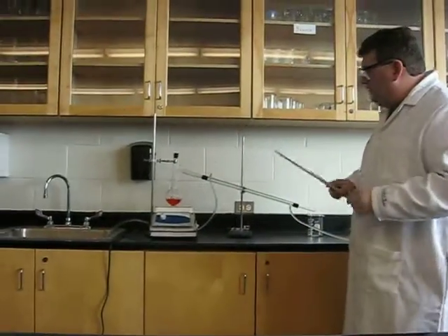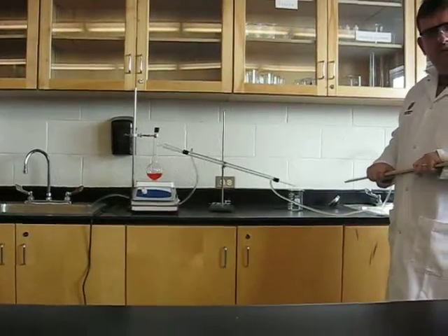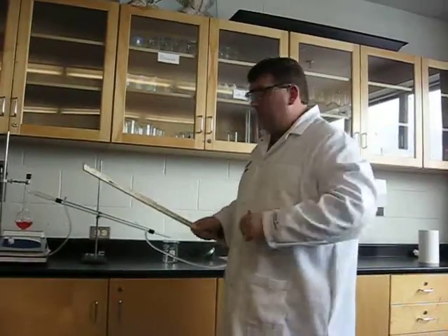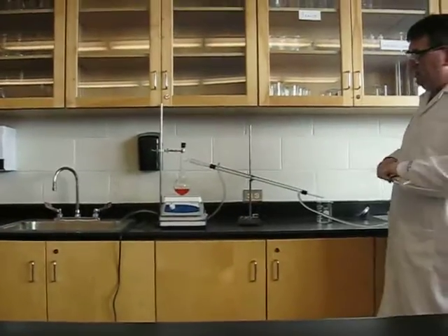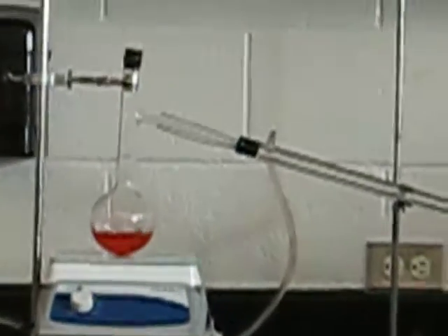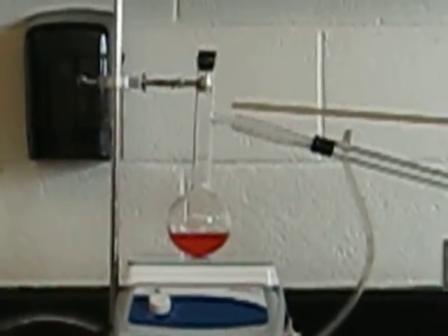And now let's have a look at today's apparatus. We have a distillation apparatus set up. Distillation is used in a variety of places. Oil refining is one example that we would find everywhere we go. So, in our distillation apparatus, we have a heat plate, we have a condenser, we have a beaker at the end to catch our liquid, and we have a flask with a side outlet.